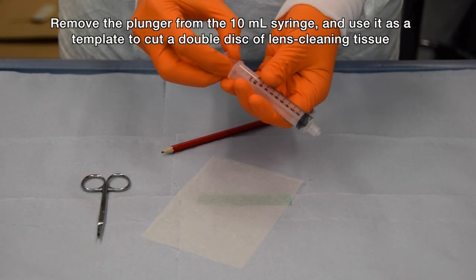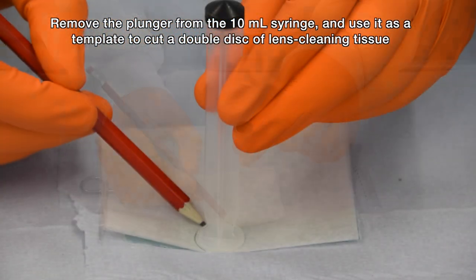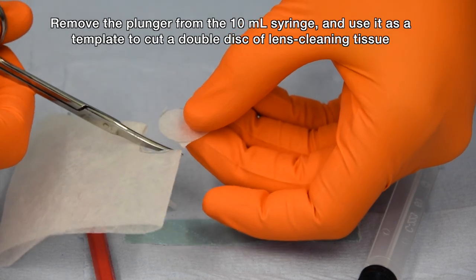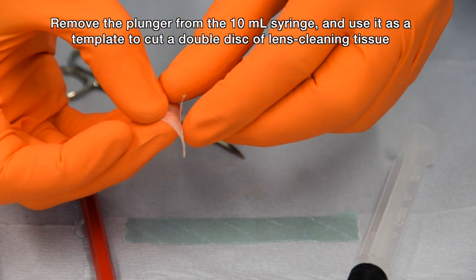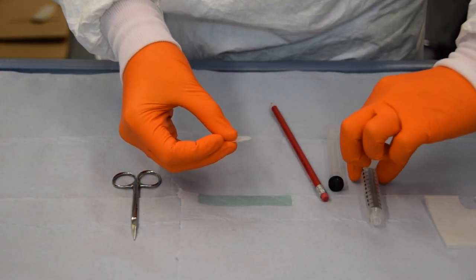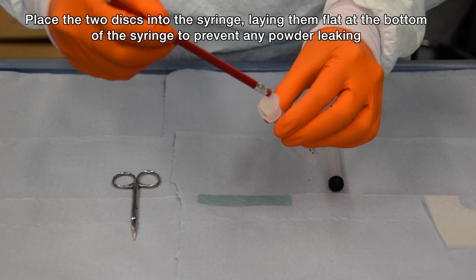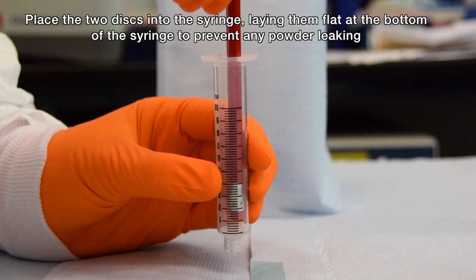Remove the plunger from the 10ml syringe. Using this as a template, cut two discs of lens cleaning tissue. Place the two discs into the syringe using the rubber tip of a pencil. Lay these flat as a double layer at the bottom of the syringe barrel to prevent any powder leaking through the nozzle.